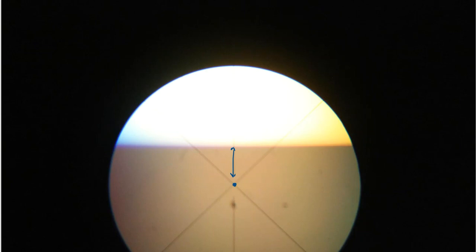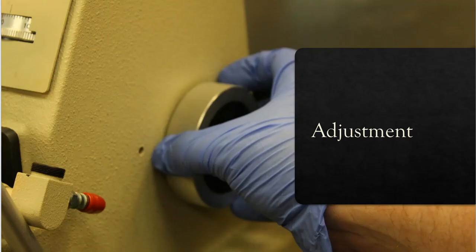So I'm going to take the big fat knob over to the right-hand side, and I'm going to turn it in one direction to lower it, and then I'm going to lower it down until I get to the crosshairs. And there we go. That's where that's at. Now I feel pretty good about what I see. All right, I see the dividing line, light half, dark half, right there in the center of the X. It looks pretty clear. I mean, I see some fuzzy over here to the sides, but that's not a big deal. I'll see some orangey red color here and some blue color there. But here in the center, it's pretty distinct. So I feel good about the view. I feel good about the setting. No more adjustment is made.